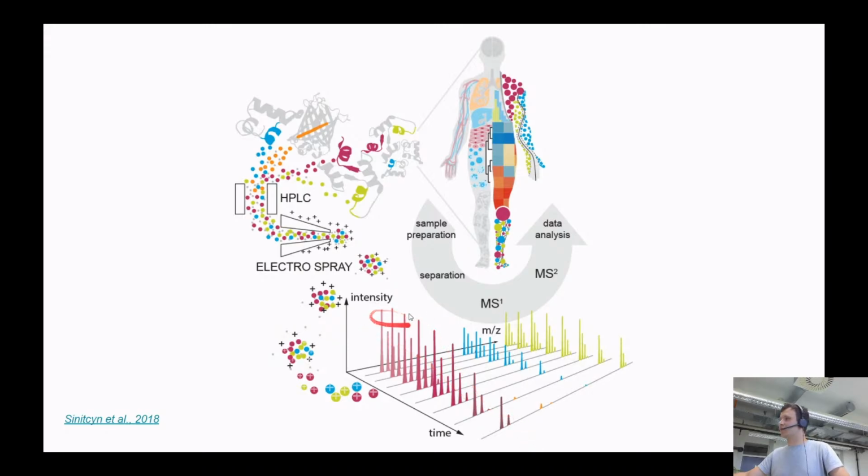So it's like we were at a really high peak at a certain moment, and now we're going down. We also see that some peptides are totally disappearing, but we also see some, for example, this orange one, just appearing from the column. It's just starting to leave the column. This is just here. Okay, cool. So as a result, we see such waves of appearance and disappearance of the different peptides.